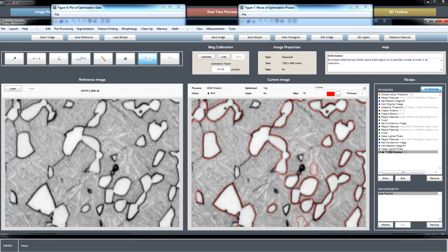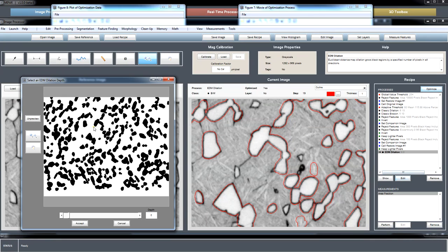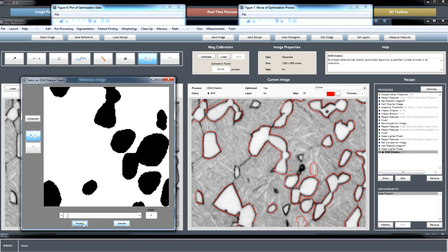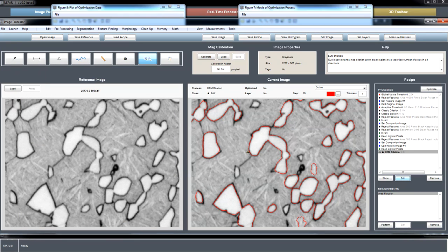Which is right outside of the gradient now instead of just inside. So you sometimes have to decide whether you want to defend your segmentation based on your experience, where I probably would have chosen a depth of 4, or whether you want to just let the numbers do the talking and defend them for that reason.